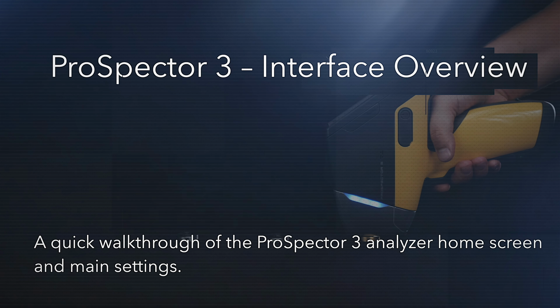So let's get started. After you turned on the device, entered the password, and accepted the safety radiation notice, you will see the analyzer's home screen. On the main screen, you see all the calibrations that are installed on our laboratory device. The number of calibrations may vary depending on which calibrations you have ordered at our facility.